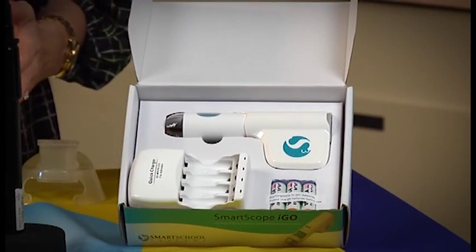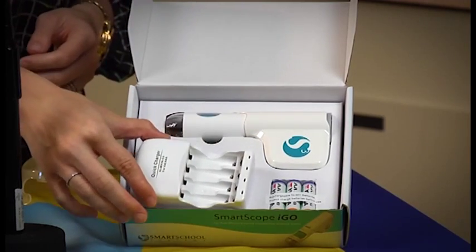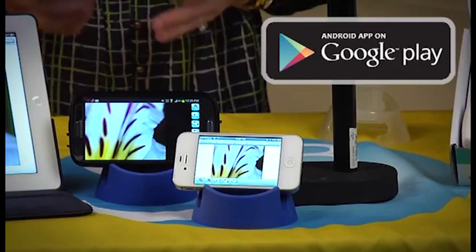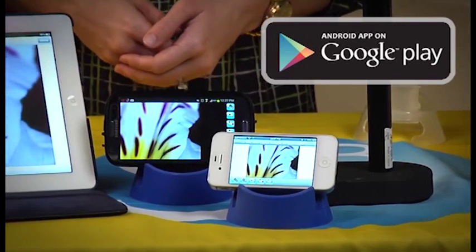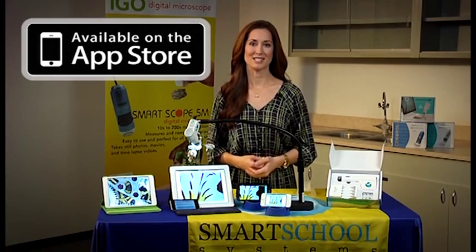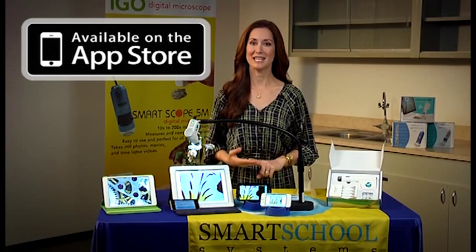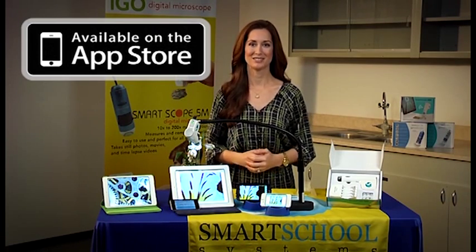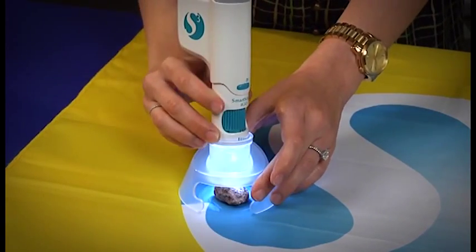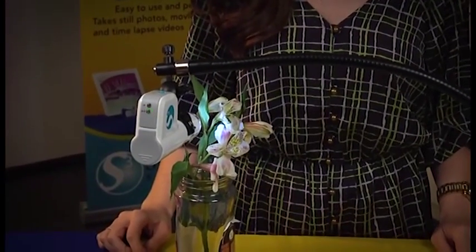The SmartScope iGo comes with everything you need to get started. You get three rechargeable AA batteries as well as the charger. The software is free and easy to install. For Android devices like smartphones and tablets, visit the Google Play Store. For Apple devices like the iPhone, the iPod Touch, the iPad Mini, and the iPad, visit iTunes. We also offer educational kits that include things like the Cradle for hands-free operation and the Gooseneck stand so you can position it exactly where you'd like it.